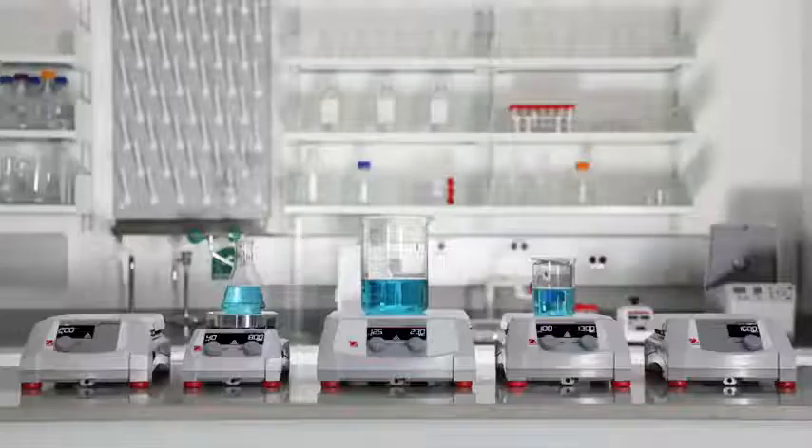Select from the five models offering affordability, durability, and reliability for your everyday heating and stirring needs.